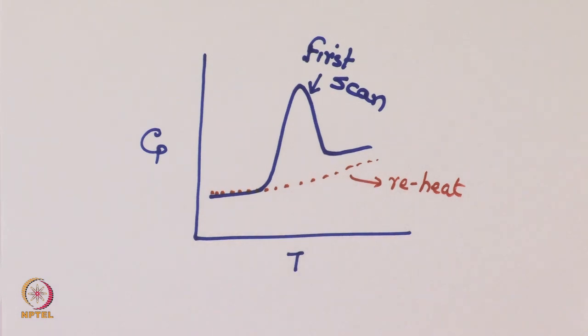And let us keep in mind that the laws of equilibrium thermodynamics can be applied to the reversible system. Therefore, it is very important to establish whether the folding unfolding process is reversible or irreversible. And as I mentioned, differential scanning calorimetry can play a significant role in this.